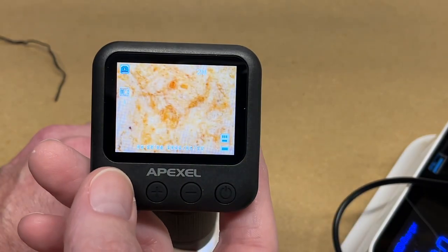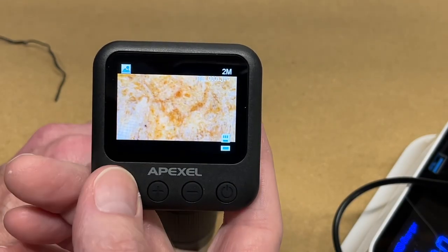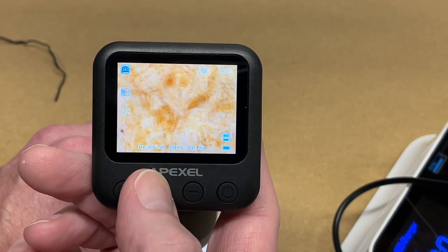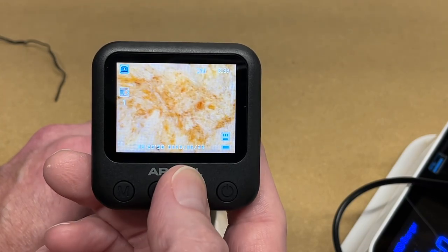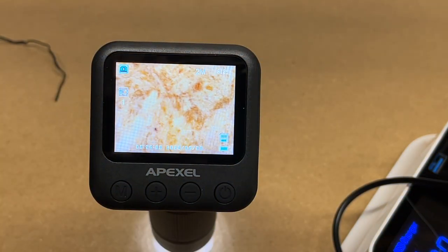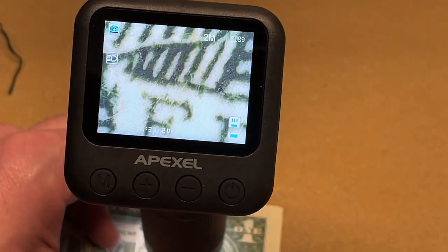We were in photo mode. If I wanted to take a photo I could press the power button once — we took a photo. I can go to playback and see that photo. That's very easy to use. We can zoom in and out with the plus/minus — this is a digital zoom. And we can adjust the brightness of the light by holding the button down. So let's get some objects.